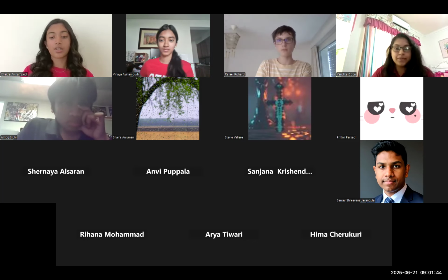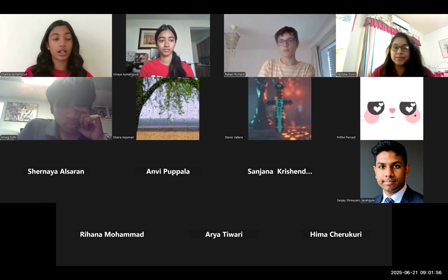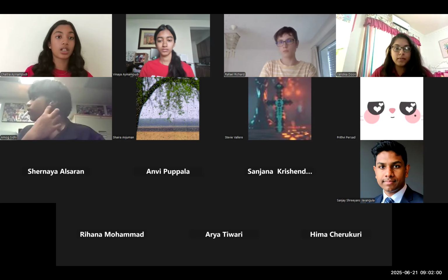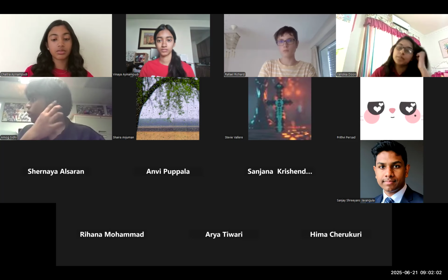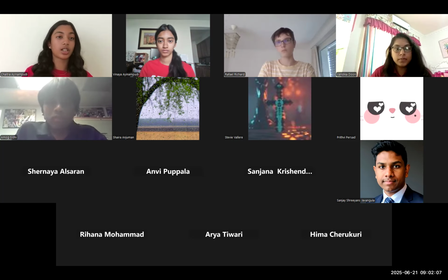Okay. So this one is specialized for just transforming bacteria using E. coli competent cells, and the P minus and P plus bacteria with an LB solution. It would be different for each experiment, because each has different components that would make the lab vary.